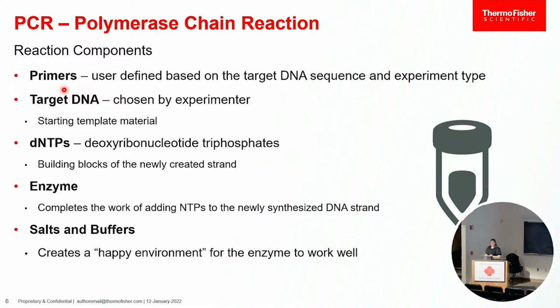Then we've got target DNA. This is our starting material for our amplification process. It's of your choice. I go out into the parking lot or the bathroom and I collect swabs off of everything and see how dirty it is. That's sample. It can also be material from a cell line. It can be so many things. There is DNA everywhere. And you'll understand that when you start working with these amplification reactions. There's DNA everywhere in life.